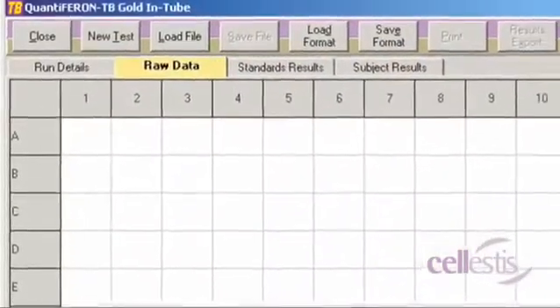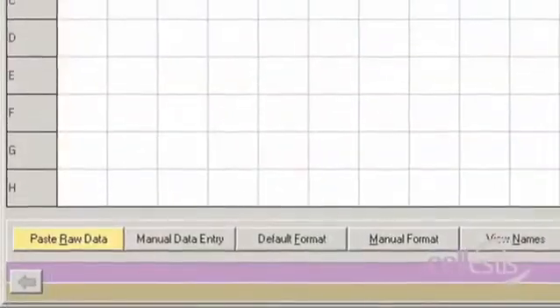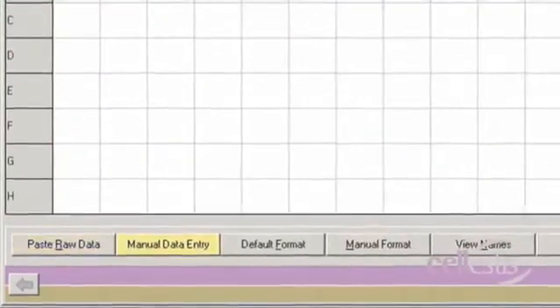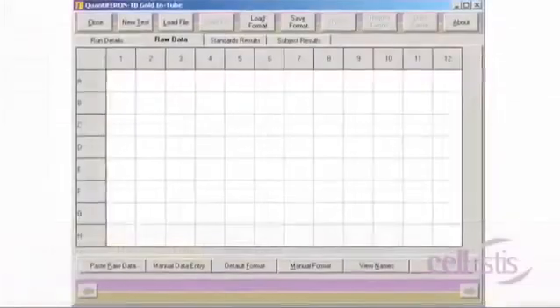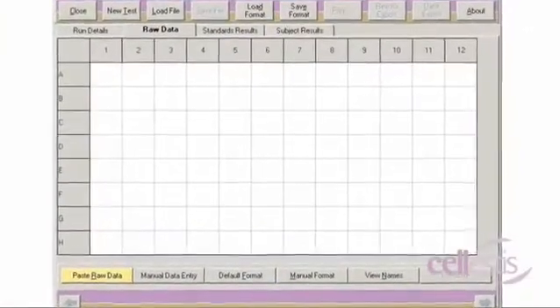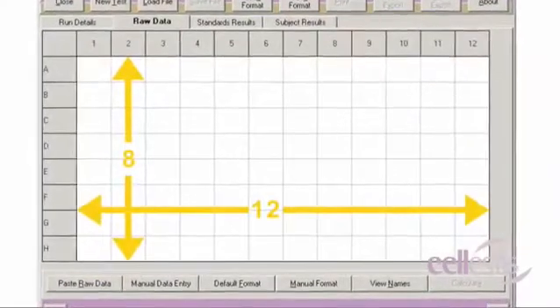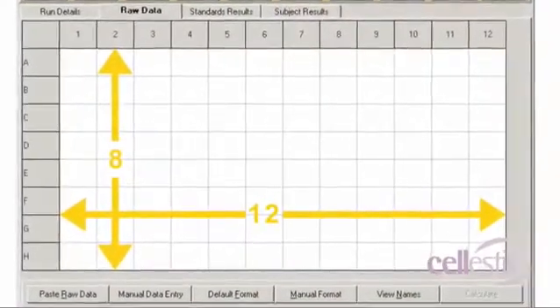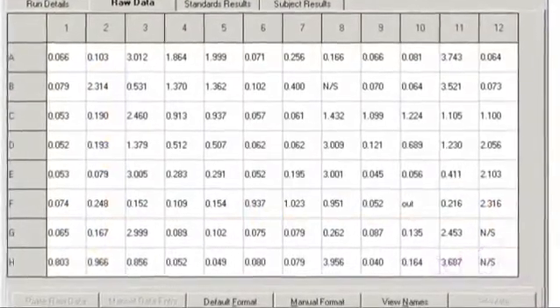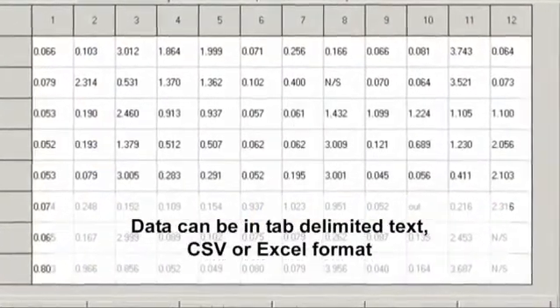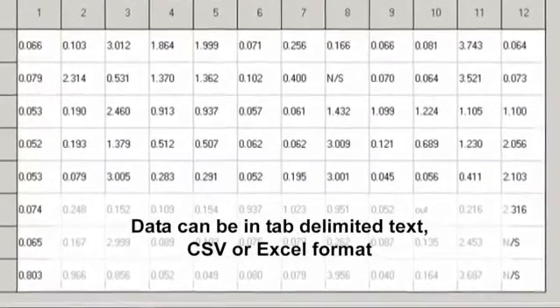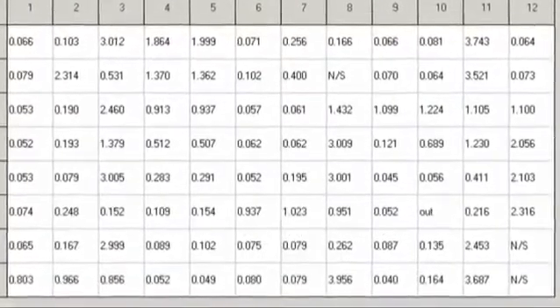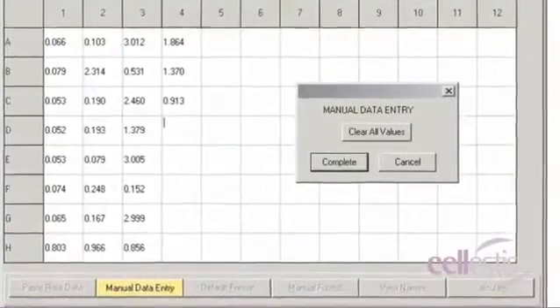Under the Raw Data tab, raw data can be entered using either the Paste Raw Data or Manual Data Entry function. To use the Paste Raw Data function, the OD values generated from your plate reader should be in an 8x12 grid layout. These can be in a tab-delimited text, CSV or Excel format. To type your OD values in manually, use the Manual Data Entry button.